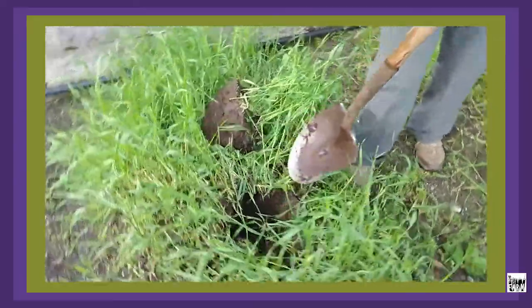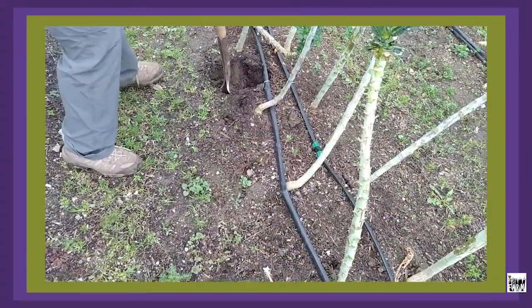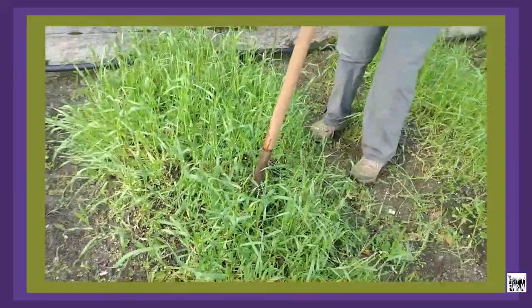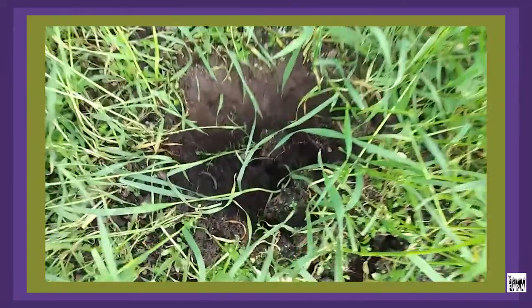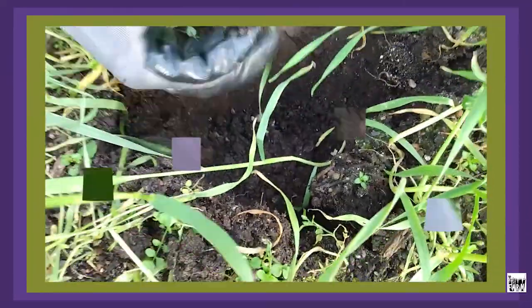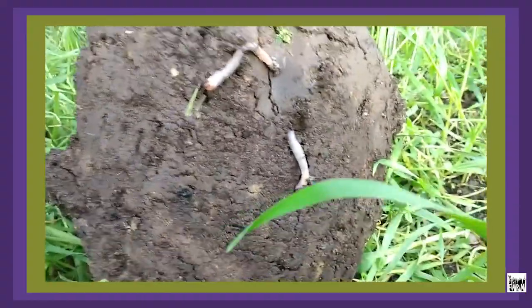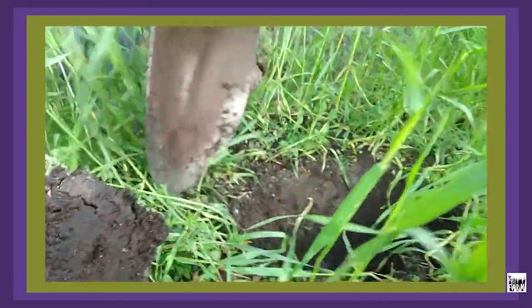Take maybe another one, then go down and take two more, then two more — mix it all up in the bucket, and then we pull from that collected bit. There are worms in here, which is really great — that's really good testimony to having really healthy soil.